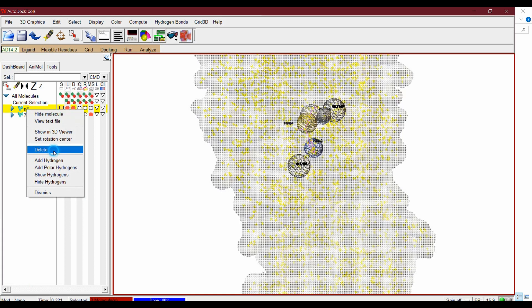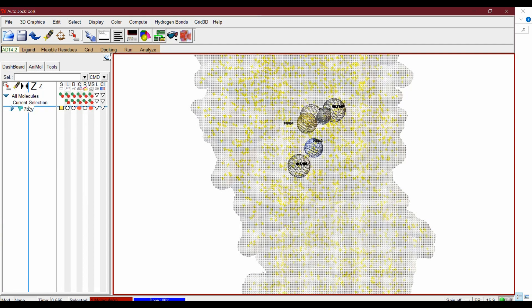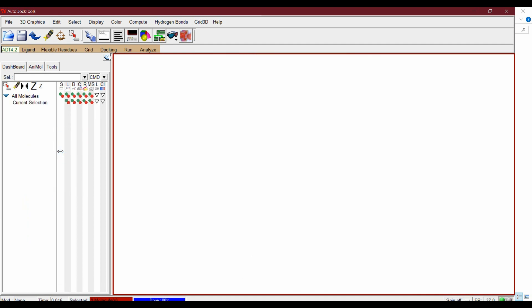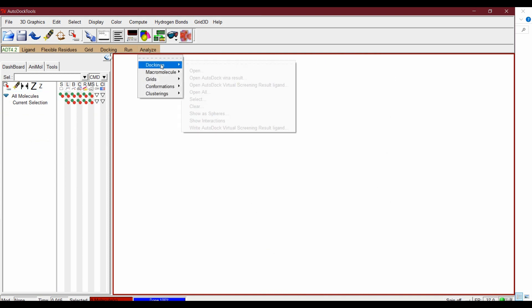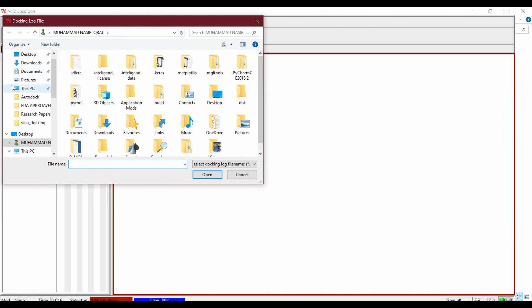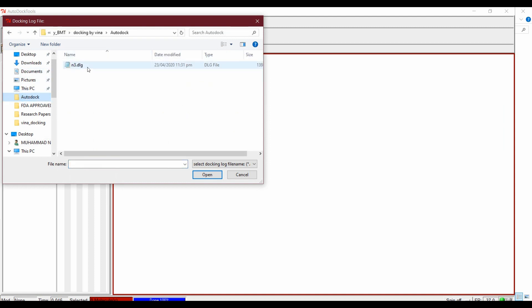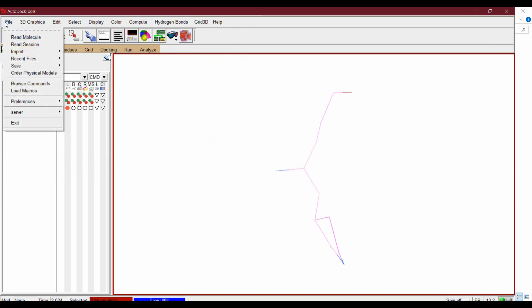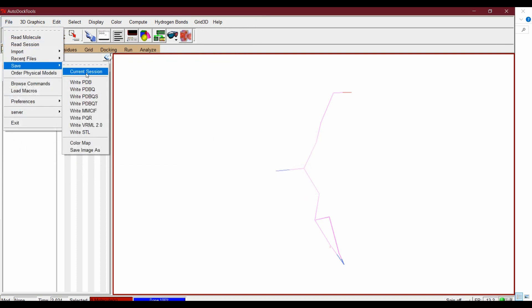Now delete them. We will analyze these results in PyMOL and Discovery Studio. From Analyze > Docking, open the result file, then go to File > Save and write PDB.